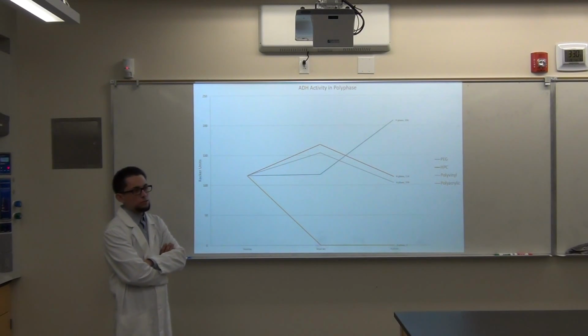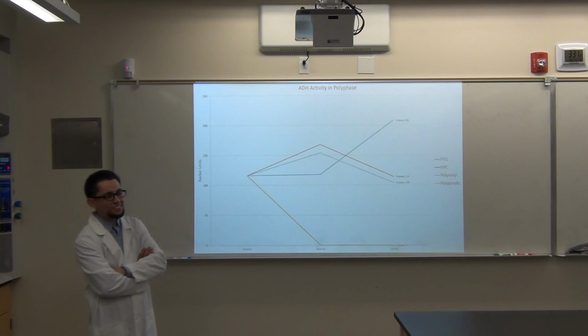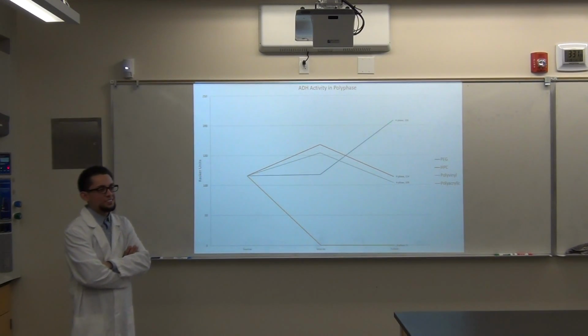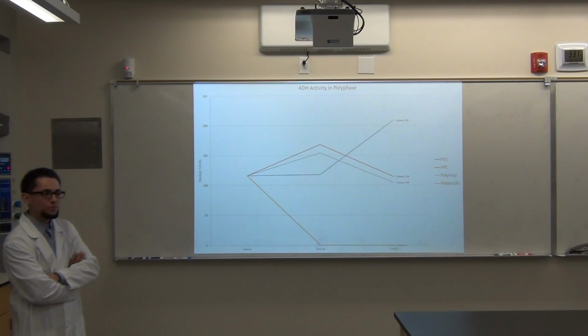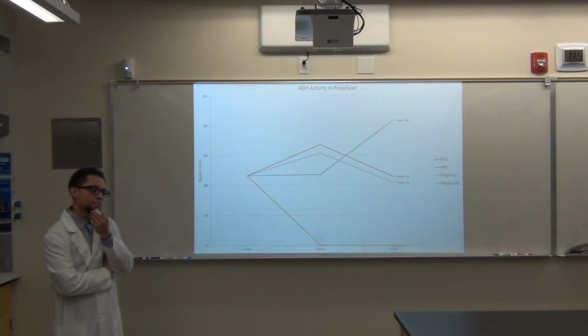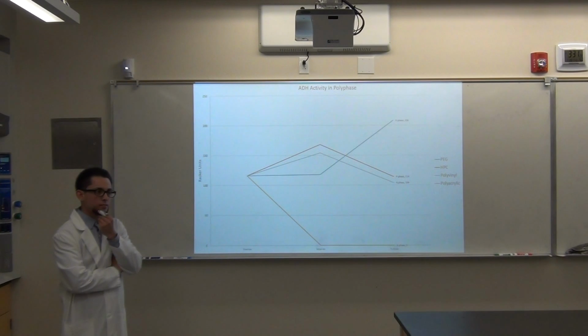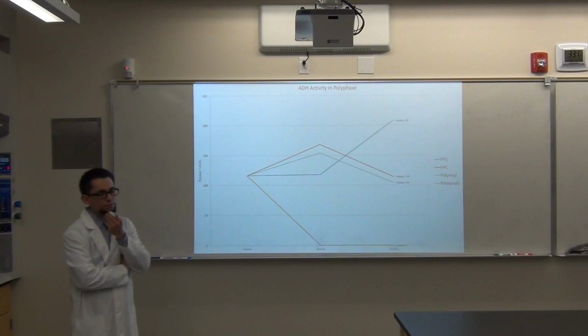So that graph where you can have the solubility of salting in and salting out, that extra salt that was added by the polyacrylic in its solid form just must have pushed it over its edge. And how could you test whether there was salt in there? Yeah, we couldn't prove that. We're going to probably deal with that next year. We salt out the protein and we see it spun down there in the pellet and we reconstitute it into the Tris, and there still could be some salt there, from the residual salting out.